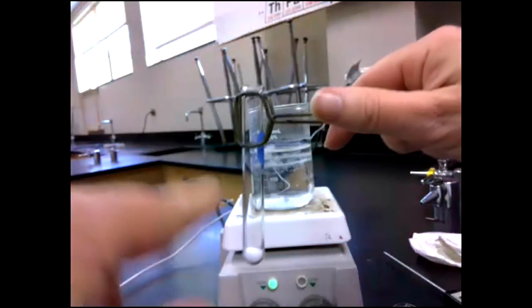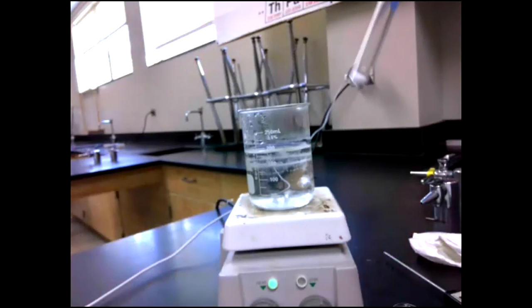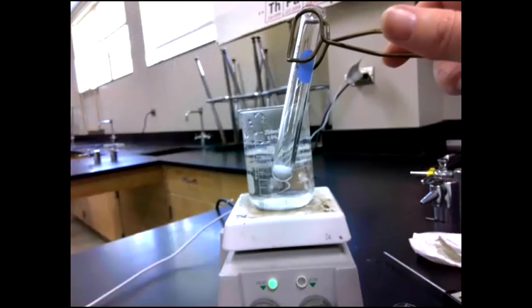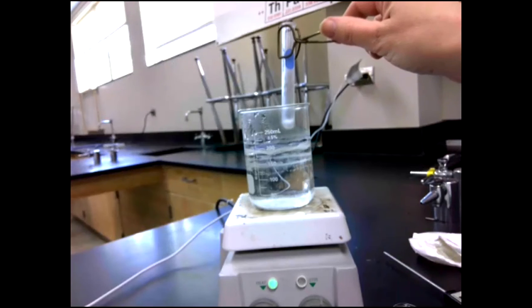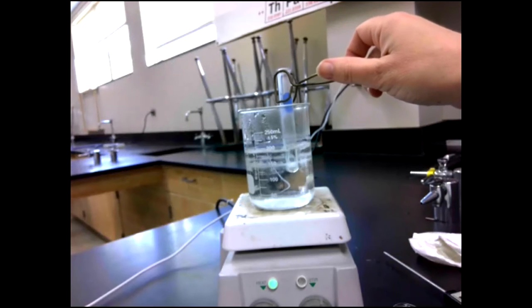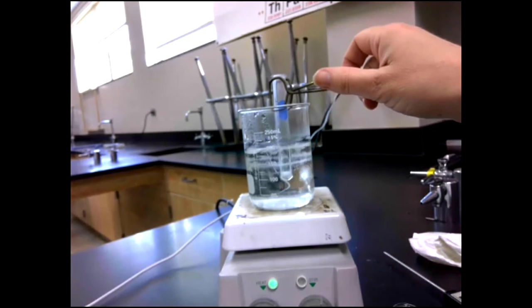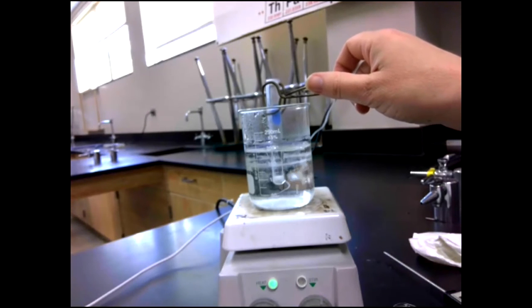So I'm gonna take A and then I'm gonna set it in the boiling water. It's really important that I don't get water in here. So I'm gonna try to set it so that the steam doesn't get inside, because it will dissolve it. We already know that. So all I wanna do is try to heat it up. Yes, you can see it. And I'm gonna leave it there for about a minute.